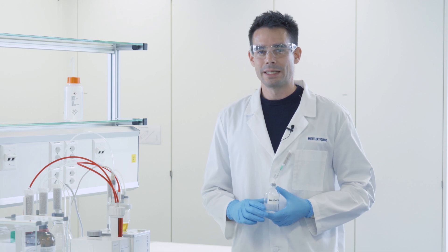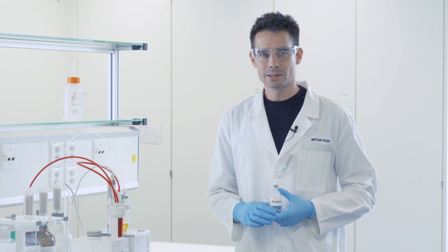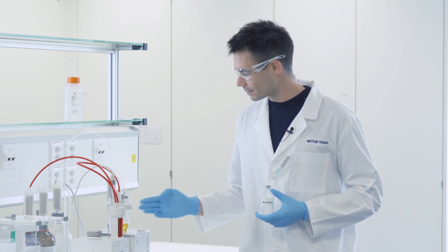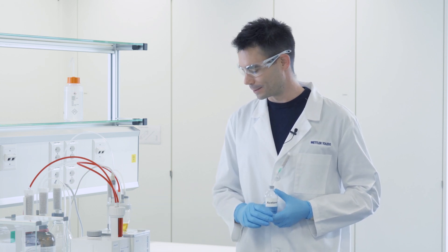Samples that contain ketones and aldehydes undergo side reactions with alcohols that are mostly used as the solvent for Karl Fischer titration. These side reactions produce water and lead to a high chemical drift or can even bias the result. To suppress these side reactions most suppliers have developed special reagents that are not based on alcohols and which suppress the side reactions.